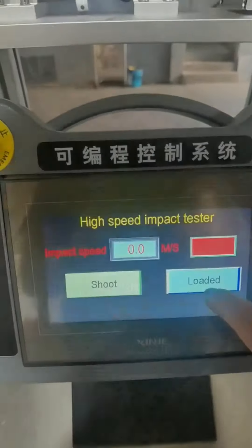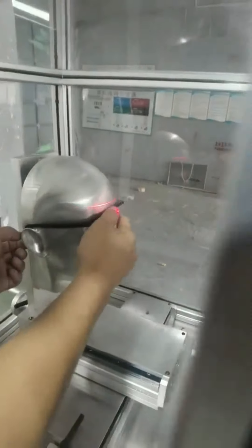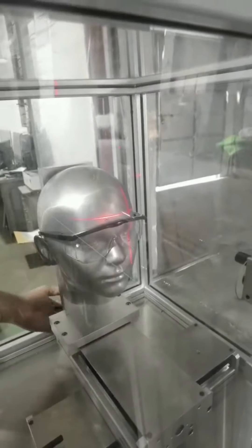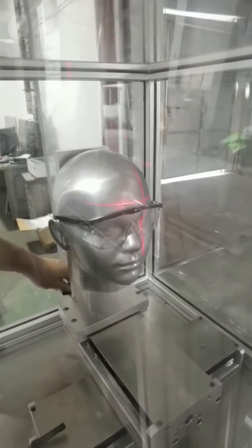Connect every source before the test. Open the safety door and place the testing sample on the headfall. You can adjust the position of the headfall using the hand-screw.